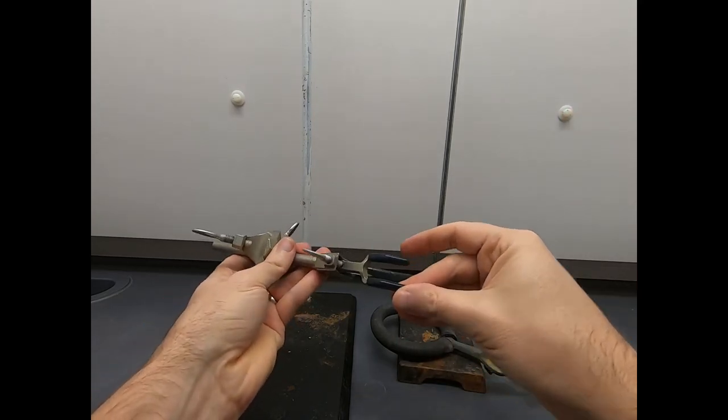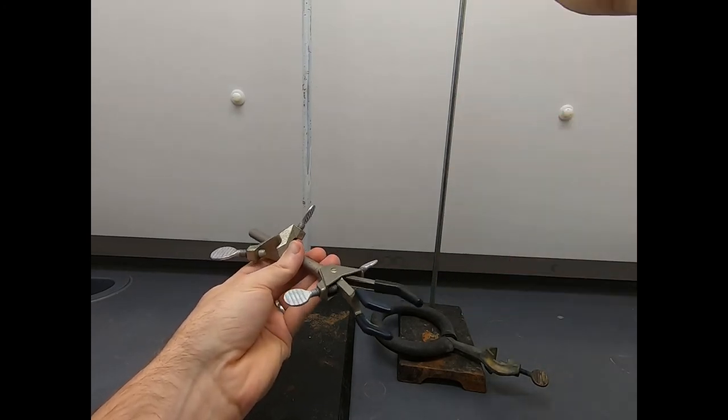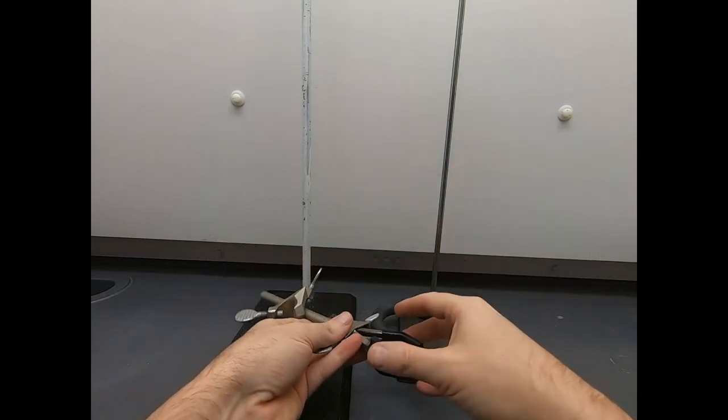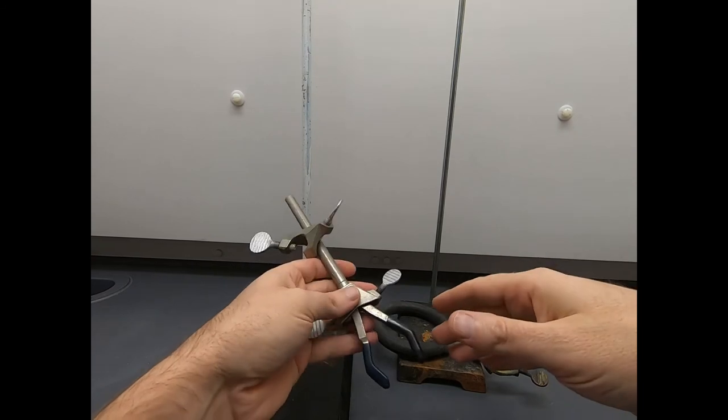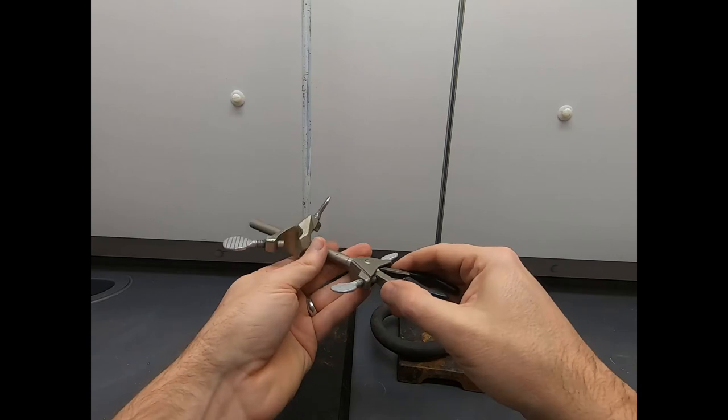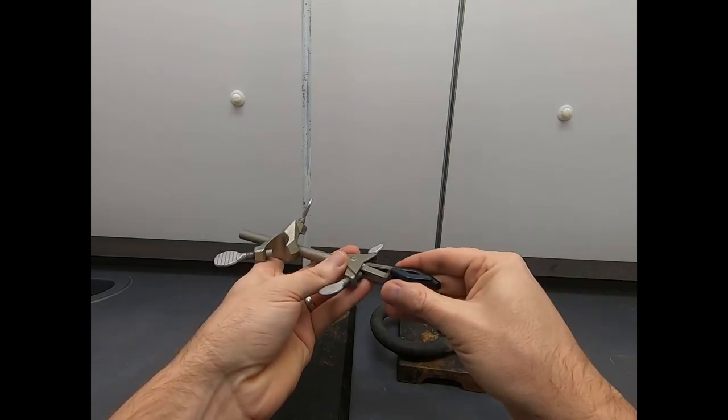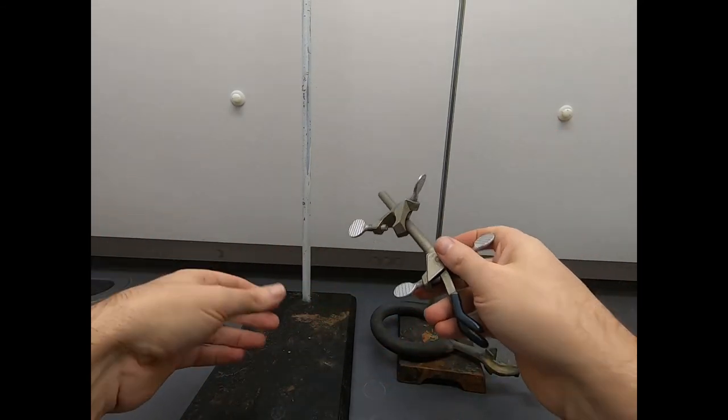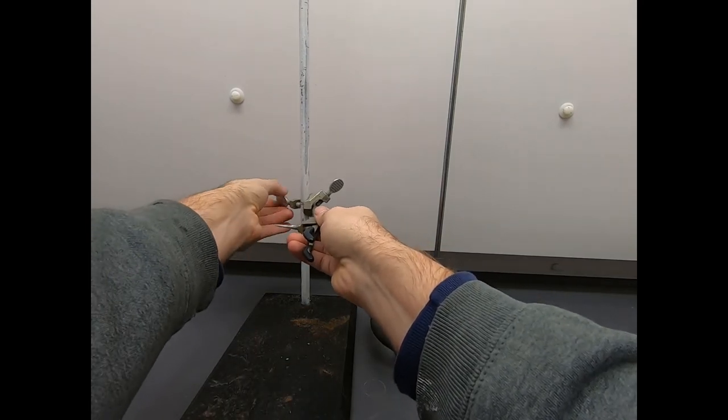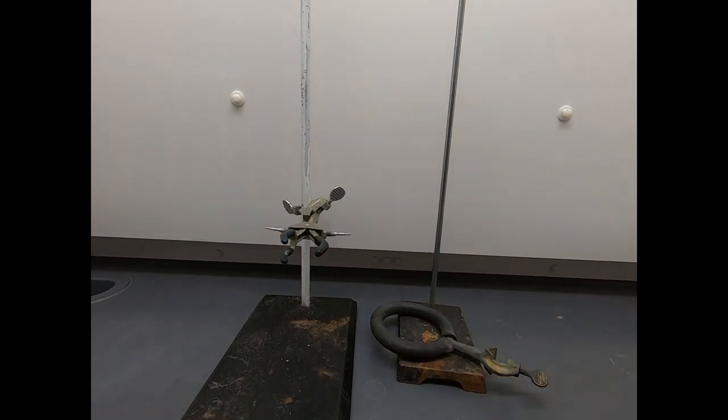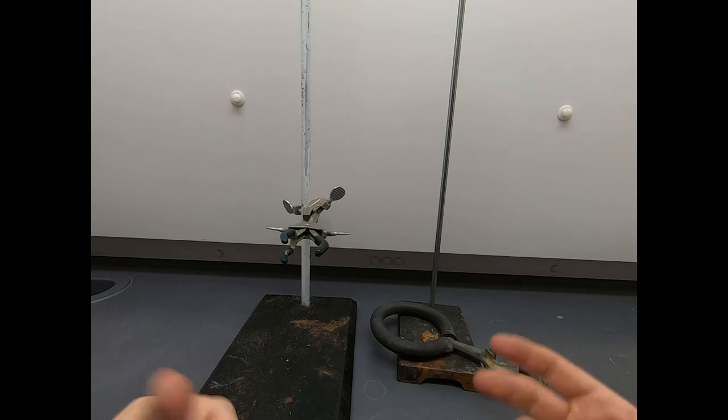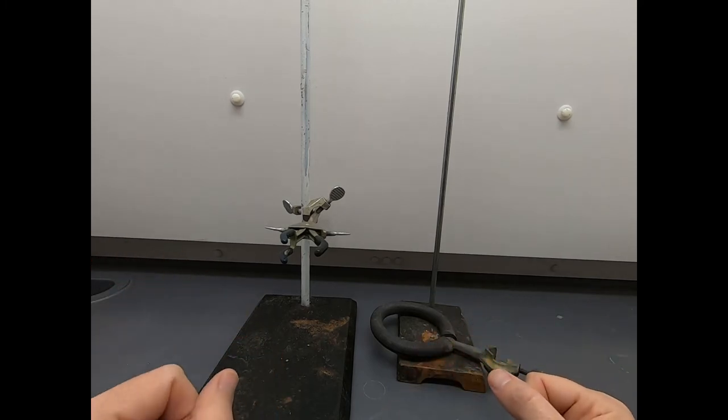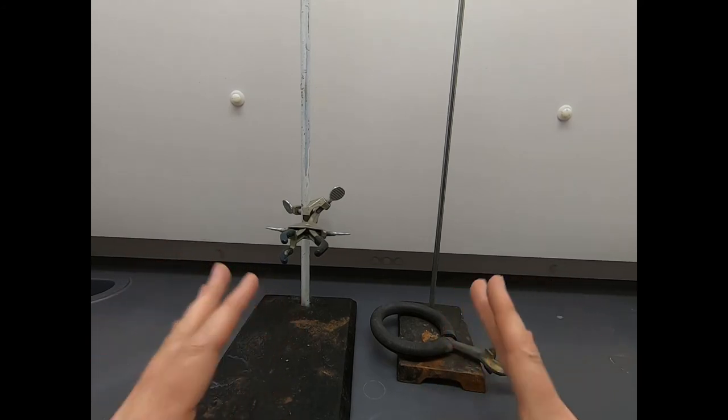One thing to be careful of: when you clamp glassware, if you have a large apparatus that has some height, you might want to clamp it in multiple places. You have to be very careful when you clamp things in multiple places because it's easy to put on one clamp, and then when you put on another clamp, you put a lot of tension and you start to try to bend your glassware. And this is a news flash: glassware doesn't bend. It tends to break. So just be really careful if you're going to clamp things in multiple places. Oftentimes people say clamp it in one place, but then provide support in other places. Normally what we're going to use clamps for is to clamp glassware into place. We might do a suction filtration, and we may want to clamp down our glassware to make sure it doesn't happen to fall over by accident. If you have any concerns about something falling over, stick it in a clamp, and then it won't fall over because when things fall over, they tend to spill, and it's very hard to recover sometimes from a spill.